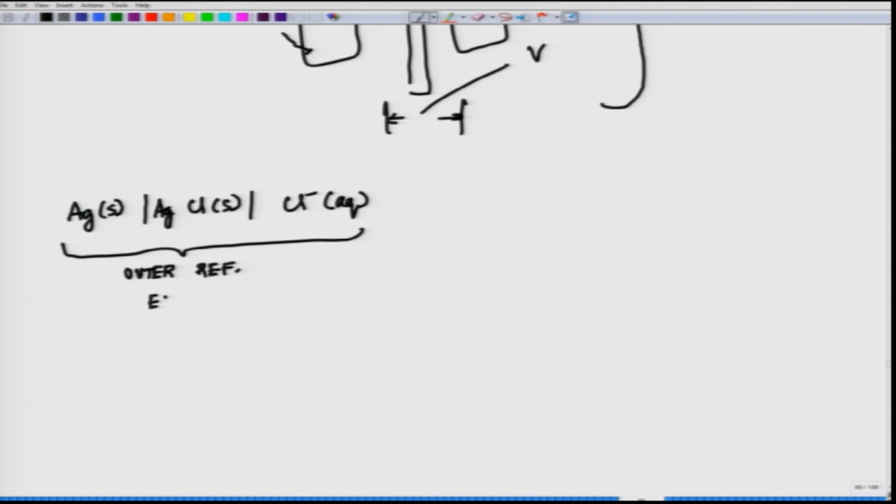Now, with H+ aqueous outside. Now, you have the glass membrane selectively bound to H+, outside glass electrode.